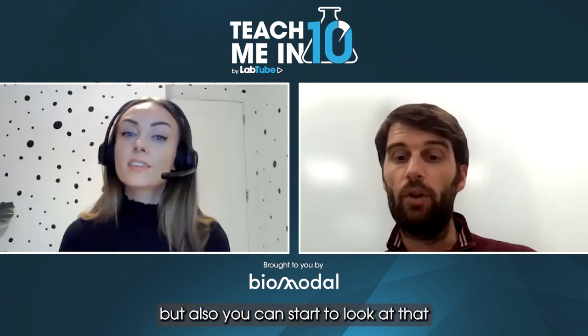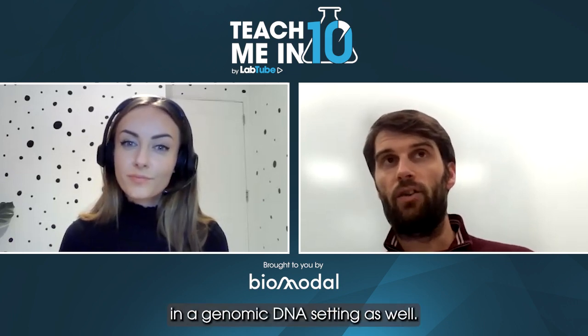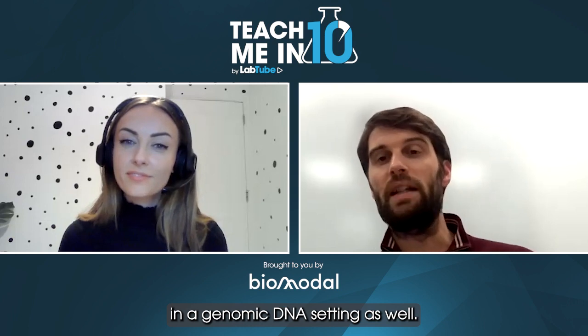Fantastic. And what additional predictive models can be generated from this 6-base genome data? Sure. So I've talked a bit about looking at enhancer status, where you can get that in-between state of enhancers where they're not off, they're not on, but they are about to be on, because there is a demethylation pathway where you go from MC to HMC and then demethylation, and that follows an activation trajectory. So that's one piece, and you can apply that in a liquid biopsy setting, but also you can start to look at that in a genomic DNA setting as well.